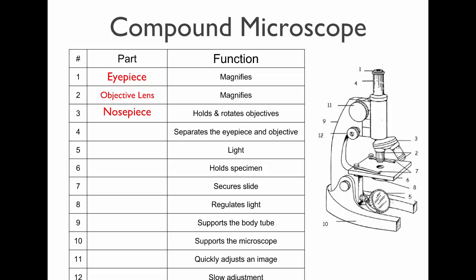Lenses work by having a focal length in order to focus the image. Did anyone ever burn stuff with a magnifying glass? If you don't hold it in the right spot, then the light isn't all focused onto a small point. In looking visually, if the lens is not focusing on the right spot, you won't get a clear image. So there is this tube here that separates those two lenses the right distance. And that is called the body tube. This part between the lenses.